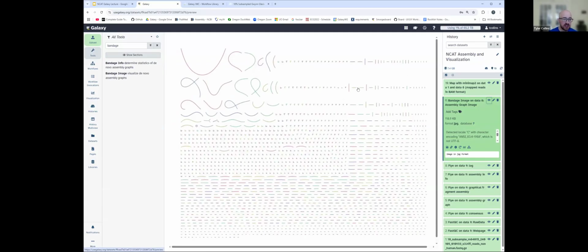So there's not much disagreement from the contig about what's actually splitting off. The two examples I would show where you can see some of that is if you look at these two kind of antibody looking ones down here, we see them forking off. Those will be kind of your unique splits. This is mostly just kind of that immediate look. You can sort of give a visualization of your graphs, what your contigs look like.